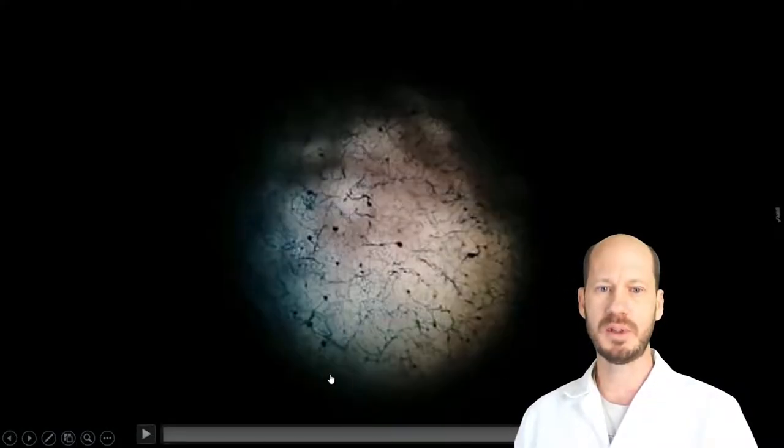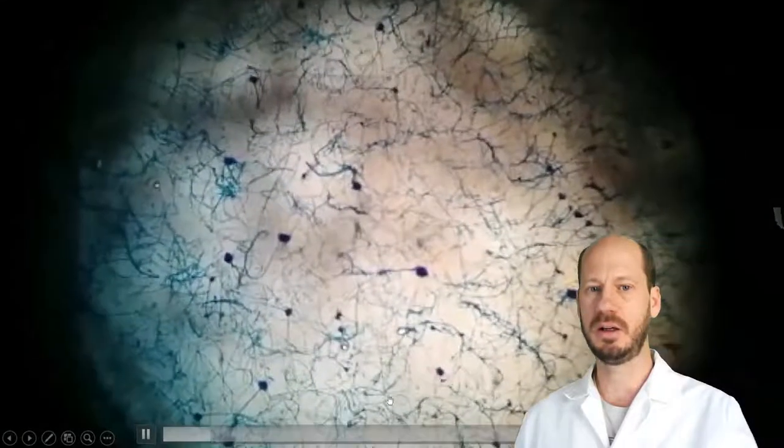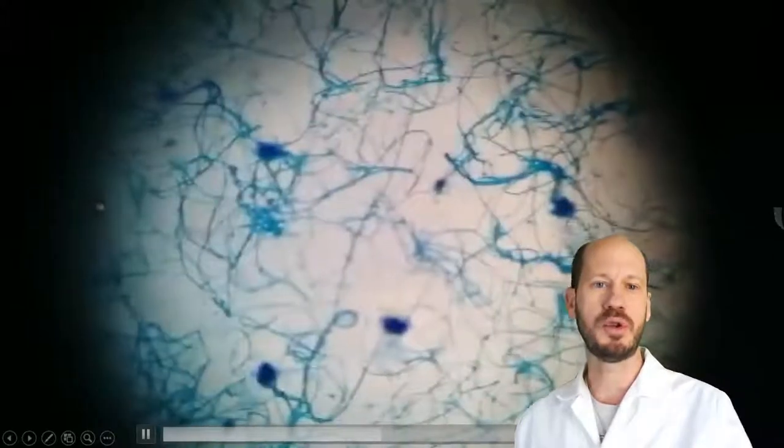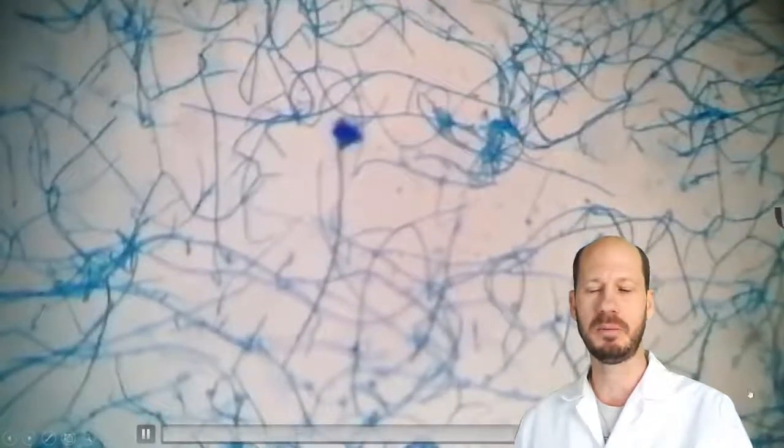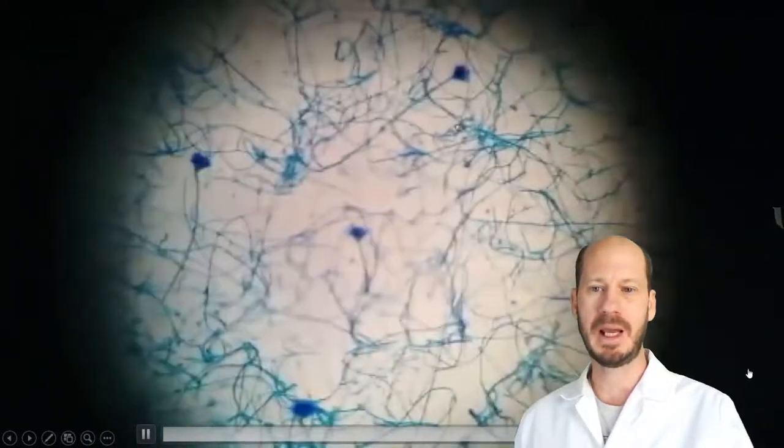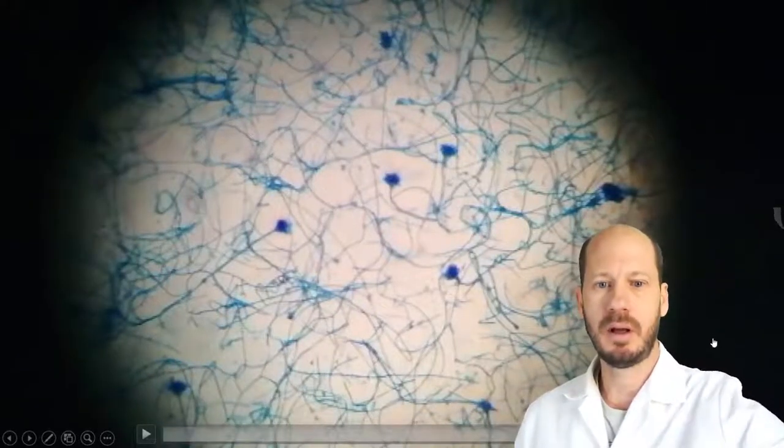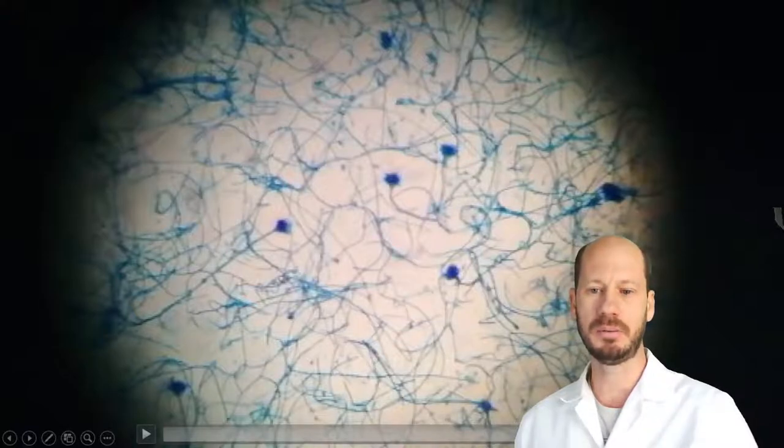This is the last here is just showing some simple staining of some fungi. And while I show the simple staining, the fungi under the microscope, I will just give you final remarks to say that gram staining for bacteria is not so useful for soil science. It's not very much used because it does not offer too much information. It will not separate you archaea, for example. There are several strains, the mycobacterium, for example, which are undefined. It's very hard to use the gram staining to separate them. And within each group of gram positive and gram negative, it's quite a broad group. It doesn't give you too much information from those microbes. And in general, the bacteria, they are in the microscope, it's very hard to identify them or use them anyway. Thank you very much.